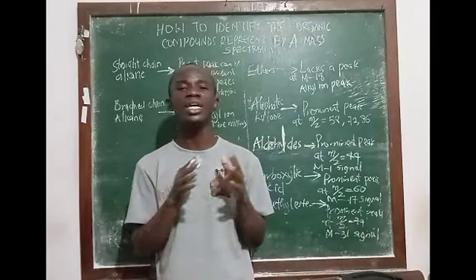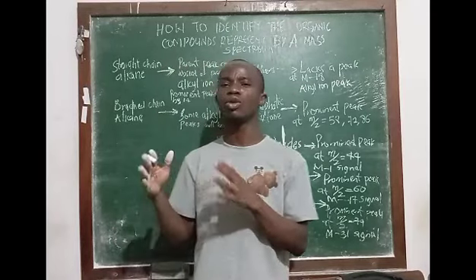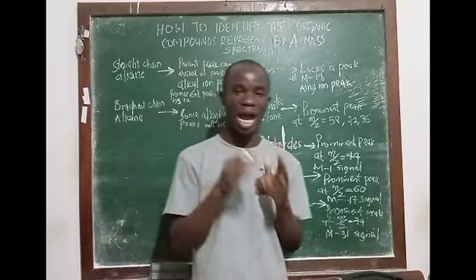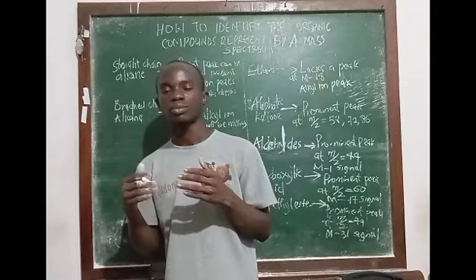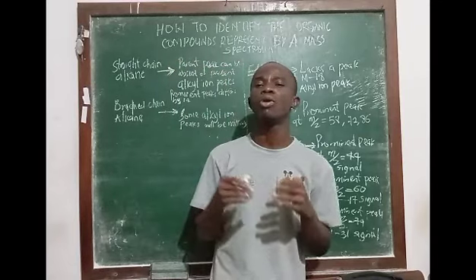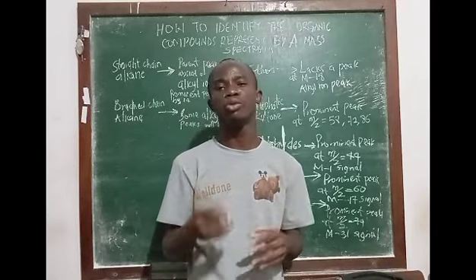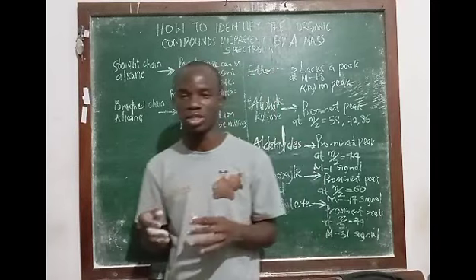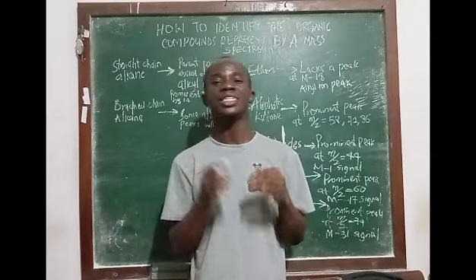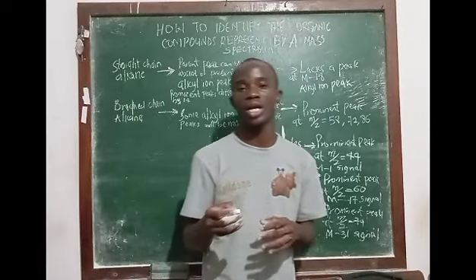So it is only in a mass spectrum that represents a nitrogen containing compound that you will have the parent peak having an odd numbered value. For an aromatic ring containing compound, the mass spectrum that represents such a compound usually has a peak at 77, which usually represents a phenyl ion, and that is also how to identify those two classes of organic compound.